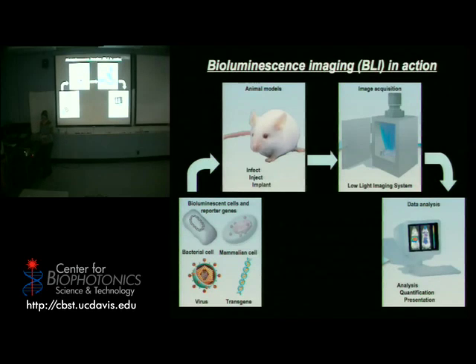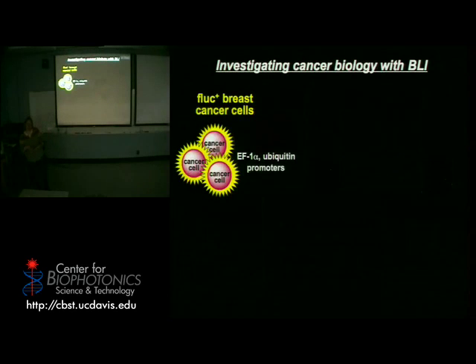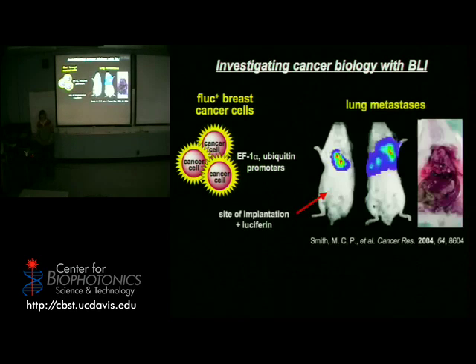So in our first basic example, there's been a lot of work done in cancer imaging using bioluminescence to simply understand how cancer cells move about, how they migrate, how they respond to therapy. In this particular example, I'm going to show you breast cancer cells labeled with the luciferase from the firefly using the genetic techniques we talked about earlier. And in almost all the cases, the promoter that we're using keeps the luciferase turned on all the time, so they're constantly glowing in the presence of luciferin, making it easy to track.